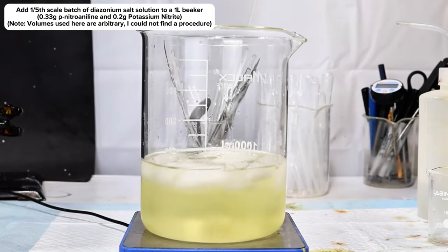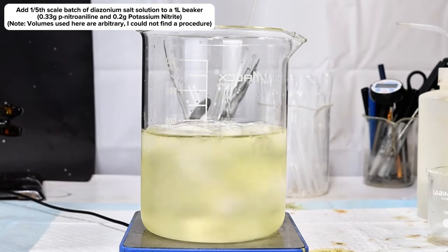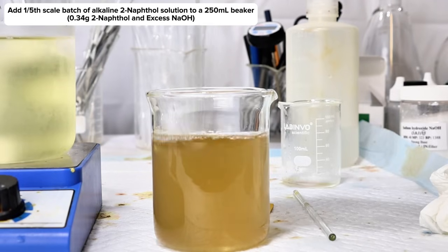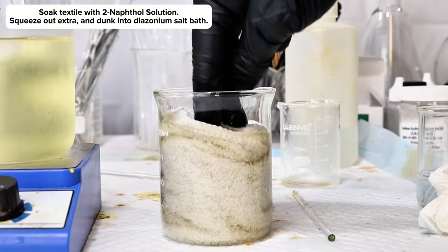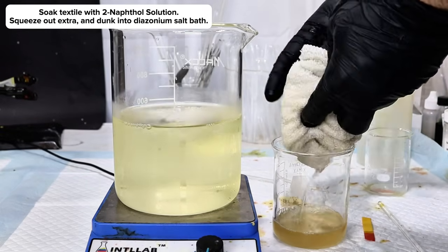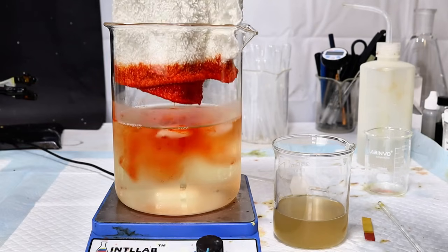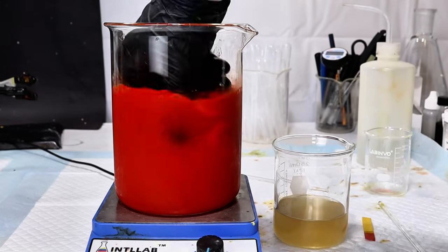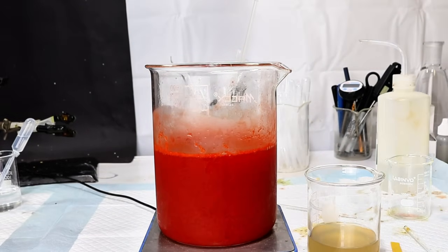To do this, I first dumped a one-fifth scale version of my acidic diazonium salt mixture into a 1 liter beaker, diluted to around 500 milliliters along with some ice to prevent the unstable diazonium salt from decomposing. In a separate beaker, I diluted a one-fifth scale quantity of my alkaline 2-naphthol mixture to a final volume of around 250 milliliters. I then immediately dipped a white cloth into the mixture, allowed it to sit for a while, carefully removed it, and gently squeezed out a bit of the excess liquid. I then slowly lowered it into the acidic diazonium salt bath, which instantly dyed the fabric a brilliant red. This was allowed to sit for a minute, removed, rinsed thoroughly with water, and then run through the wash to test the fastness of the dye. Even after going through a full high-heat wash and dry cycle, this cloth is still a very vibrant red.